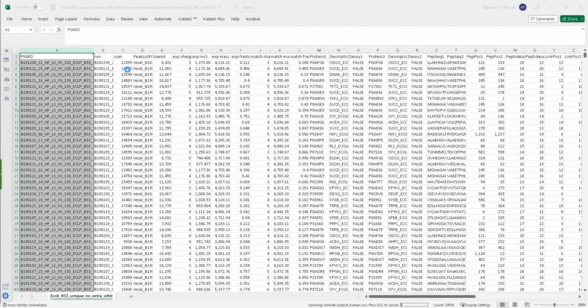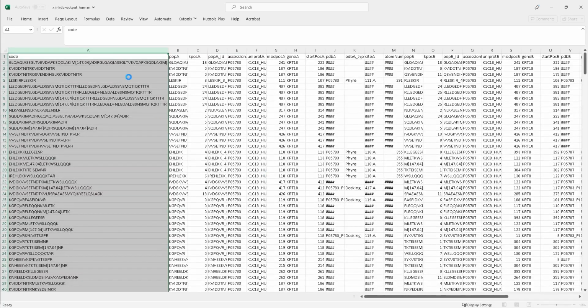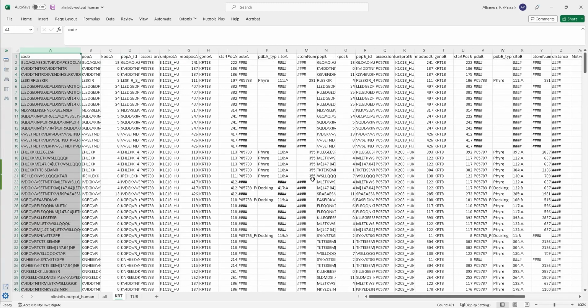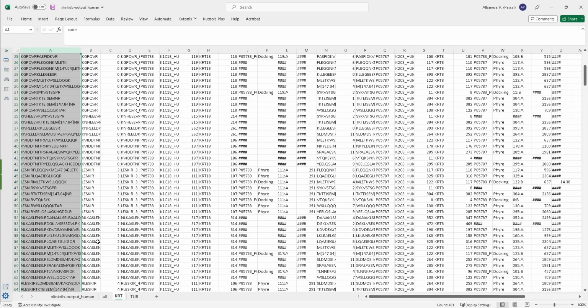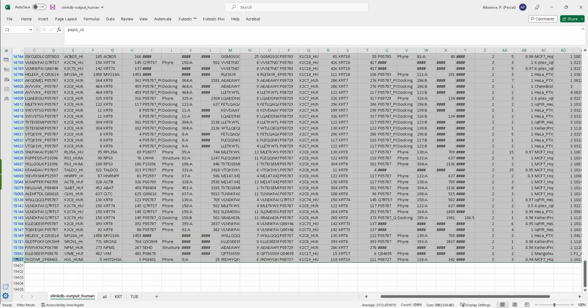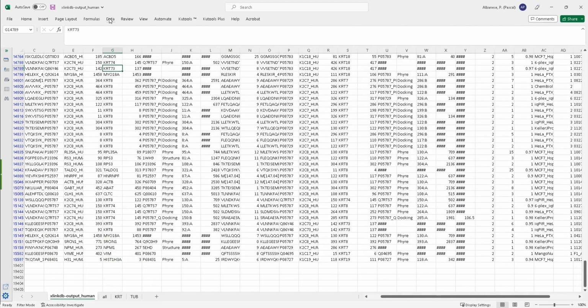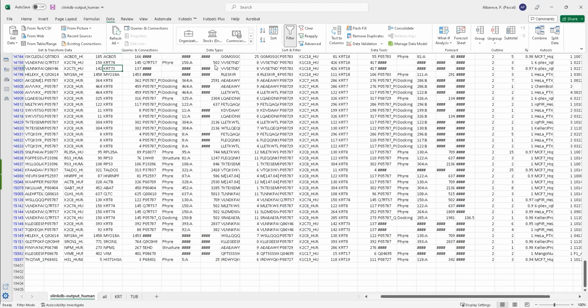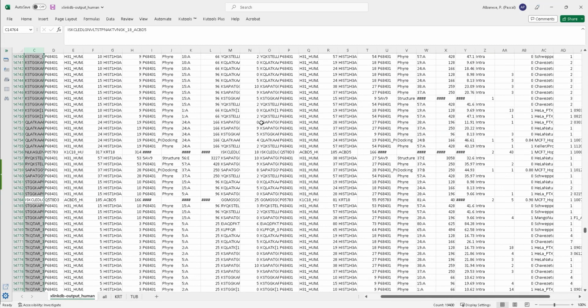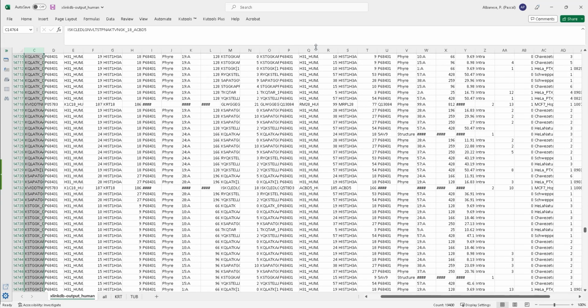You will have it here. You can see it's quite a gigantic amount of data. So we are talking about 10,000. Oh, here I applied some filters. Here we go, 19,400 lines. So from these, we can extract some of the proteins we might be interested in.